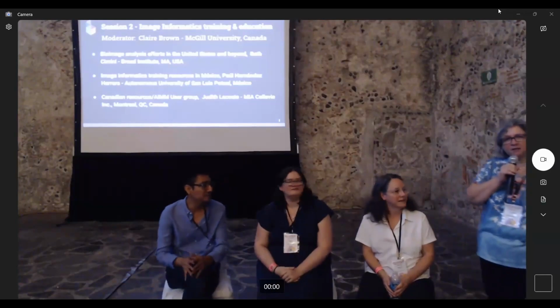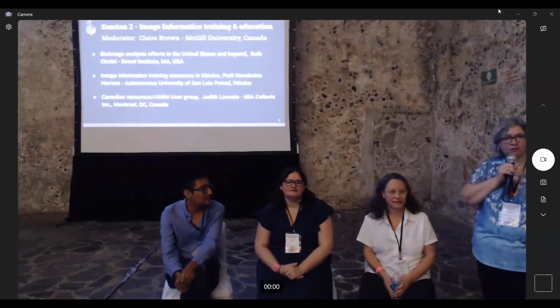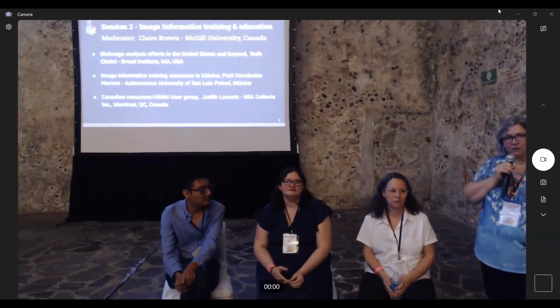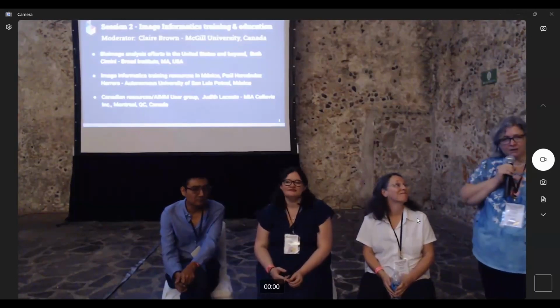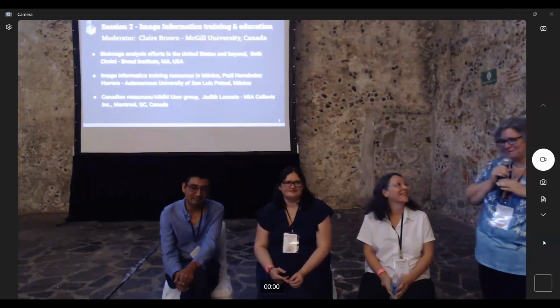I just want to add, I think for those of us working in imaging facilities where we often get to the researchers when they're at the start of the project, to really advocate for planning that whole life cycle of what do you want to measure and how are you going to manage your data. And then the pilot project, I think, is something we really need to instill in the community: do everything with a small set and don't do all of your experiments and then go for analysis.